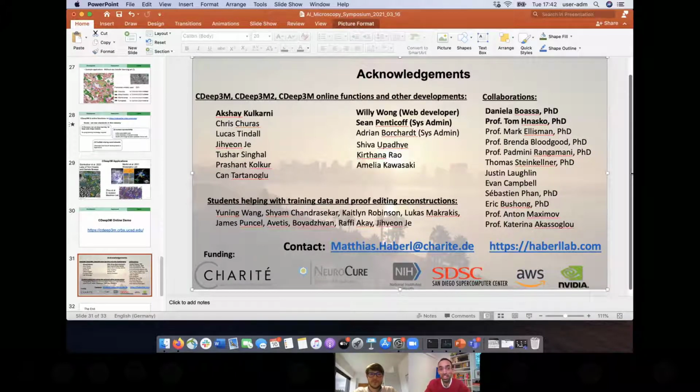But the amount of data they've accumulated over, I don't know, close to a decade now is for sure tremendous, and they have people from all over the world doing it. I would say it's probably the most challenging of all tasks, right? Reconstructing a neuron over the full run length of an axon or a dendrite. There are a lot of errors that can propagate in that space.